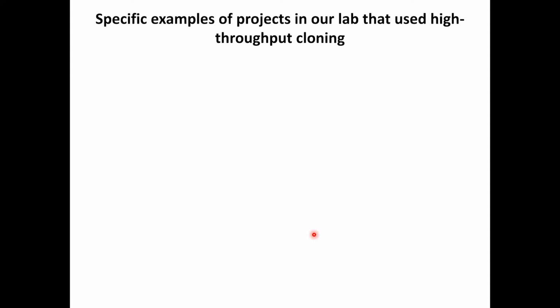Sure. So the first question is, what are the bioinformatic websites used to determine base sequences? UniProt, UniParc, NCBI, UniRef, if you want to speak to that. Sure. So specifically for CRISPR-Cas9 experiments, there's a whole host of databases that we make use of.